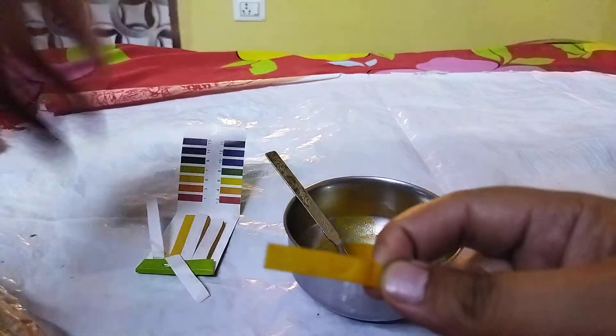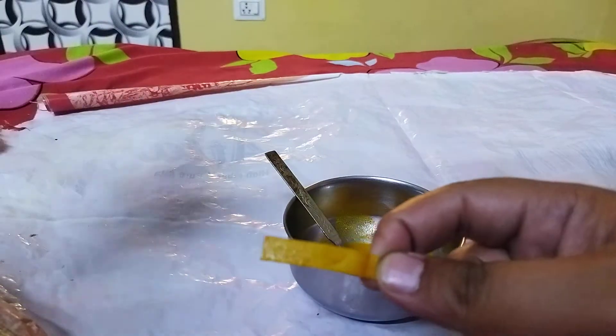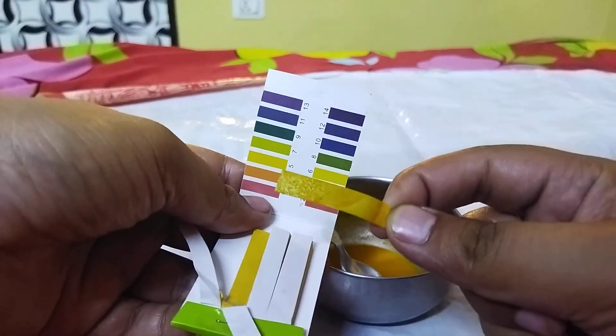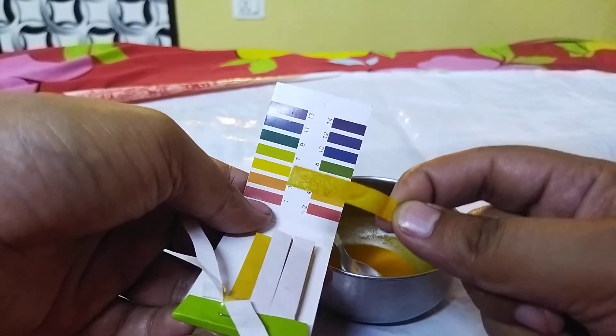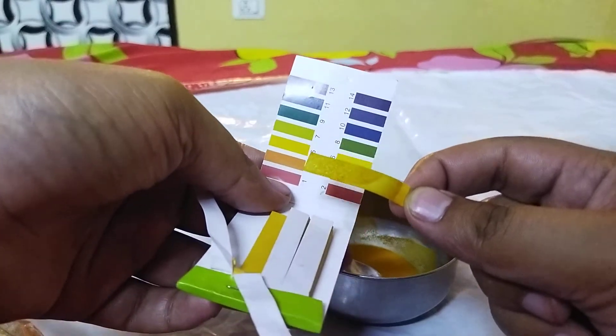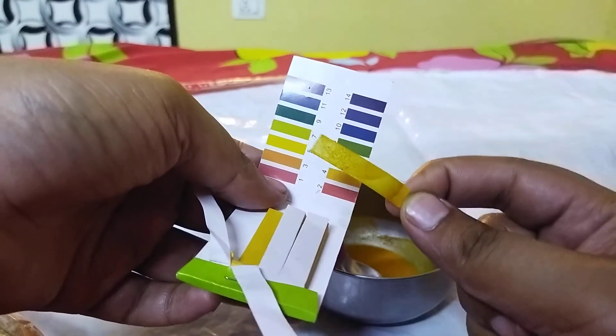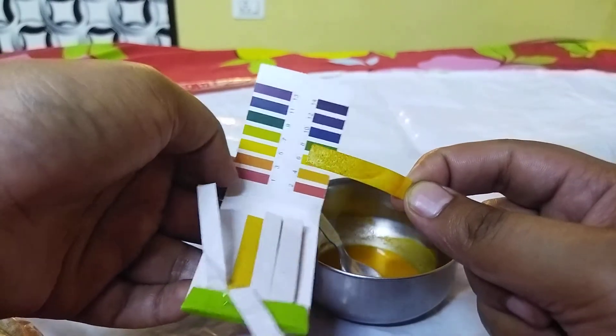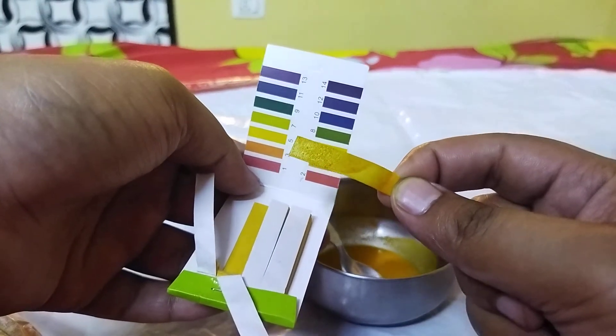I think it has dried out as much as it could. You can notice that it is slightly basic in nature — it is having a pH between 7 and 8. So we can conclude that turmeric powder is slightly basic in nature.